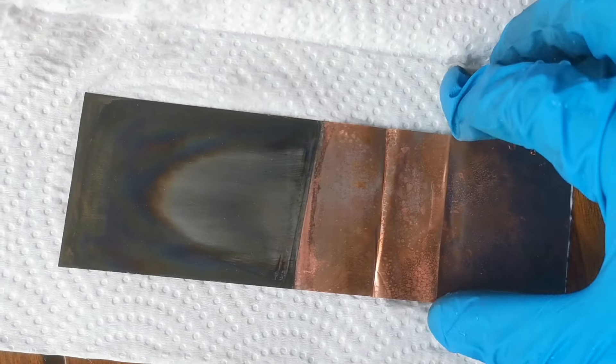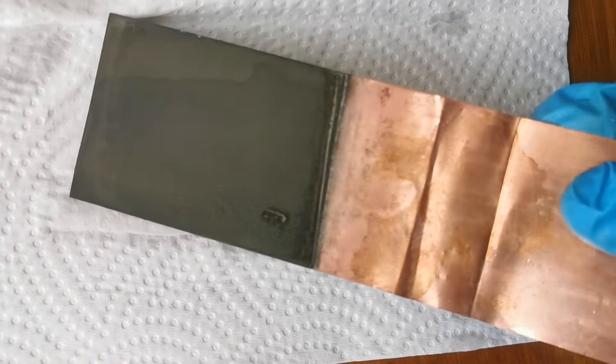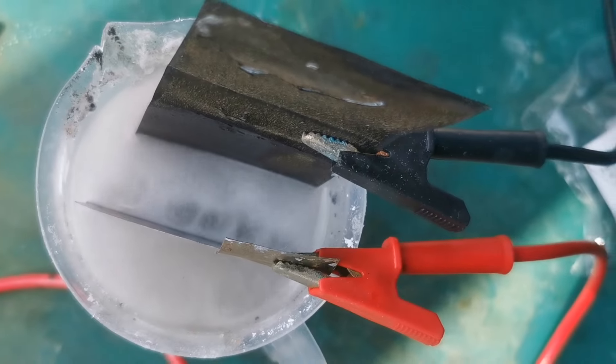And finally, after 40 minutes of electroplating, water washing, and drying, this is our nickel-plated copper electrode. Its nickel surface is not exactly shiny like the copper parts, but it is already good enough to be used as an electrode.